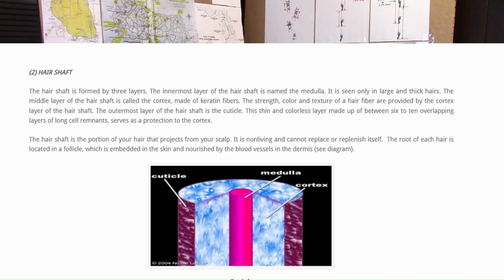And they mentioned polar bears quite a bit in this, even though I was looking for black bears and the black bear hair, the scales on the black bear, the medulla on the black bear. It's mentioned in polar bears quite a bit. So the cuticle scales strengthen and protect the hair shaft. The cuticle scales are the outside of the hair. Alright, and then I was looking at some different images here too, showing the hair, the scale patterns on the hairs. But that was the most interesting to me, about the holding in the heat, keeping them warm.